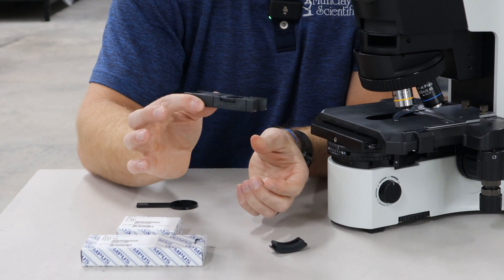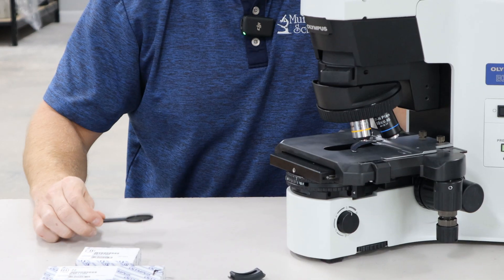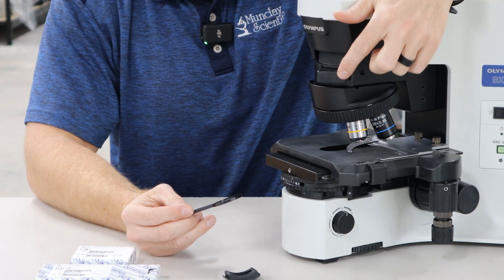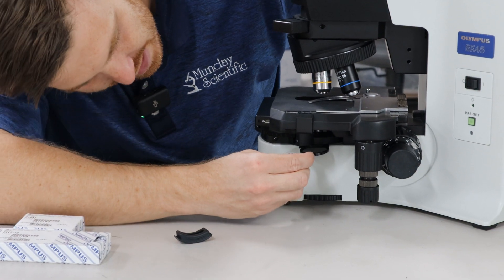Whenever you lock it in, it'll be flush. Remove your dust cap and you can slide it right into the light path. Your polarizer, whenever you order it, will come with that analyzer holder. It'll go right here under the right side of the stage.